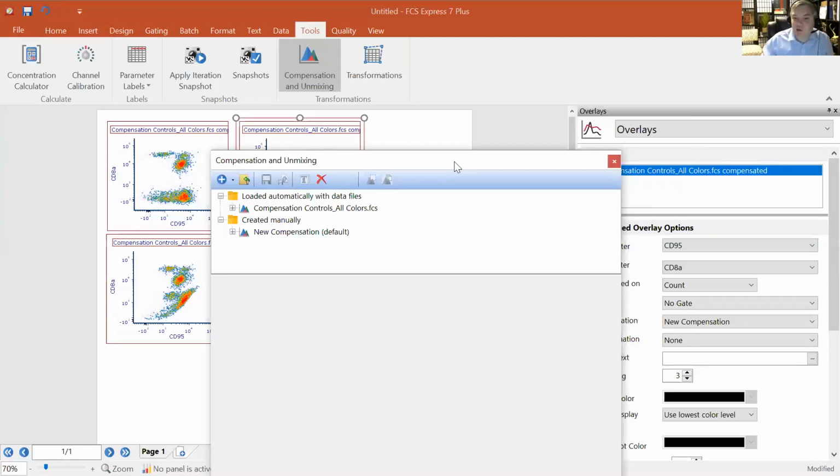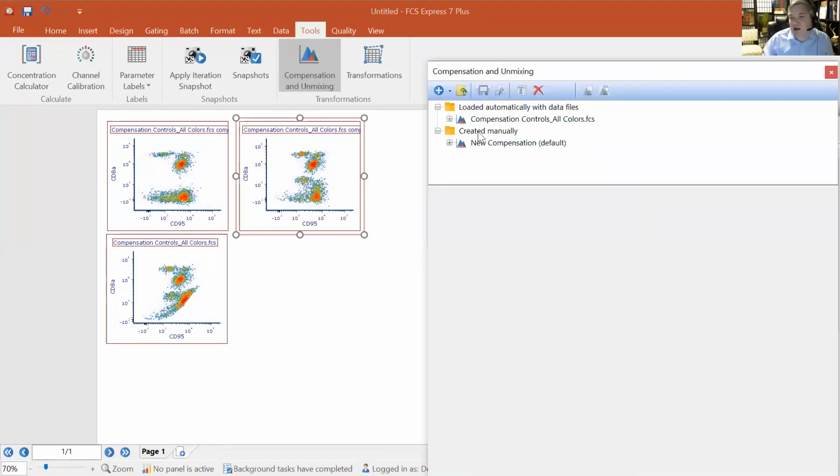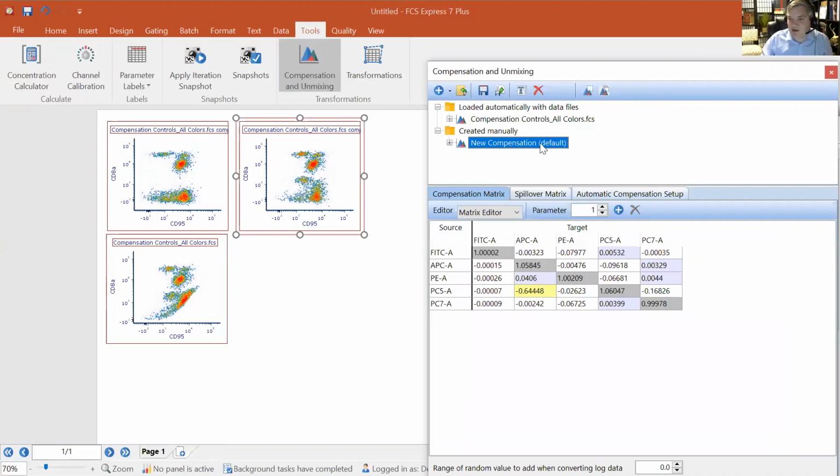And then when you open up a new layout to actually analyze the data, you can pull in multiple compensations. You don't have to work with one created manually. You could have multiple created manually in here. And depending on whatever it is you're working on, maybe you're using the next and previous buttons and using batch processing in the software. If this happens to be what you need for one particular file, load that file up in the data list, load it into everything, click on apply to all plots, and that's going to set it to use that compensation. Now you move to the next data file, or you're comparing side by side. You can grab a few plots, whatever way you want to apply it.